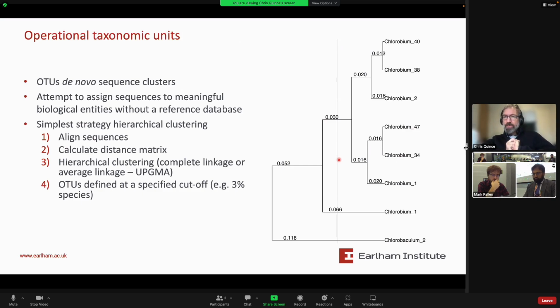Have you done multiple sequence alignment as well as pairwise alignment? Well, they touched on it. Multiple sequence alignment is just where you have n sequences and you want to align them all together. The problem with it is, as I said, pairwise alignment is slow. Multiple sequence alignment becomes even slower, and actually even less reliable. This is what people were doing 15 years ago in 16S analysis, giant multiple sequence alignments, which is definitely a bad thing.